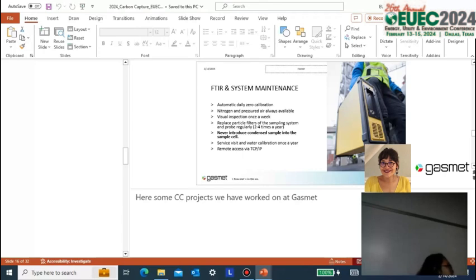GC is pretty much still the gold standard, but we're not going to beat that. We just made it easier by taking an instrument to a site, but not in such open conditions. If you're looking at open path, what's the distance they're looking at? If they're looking at very large areas, they're probably looking at eddy flux towers. They're able to measure very fine concentrations, close to parts per trillion, at the tree canopy level, over large surfaces.